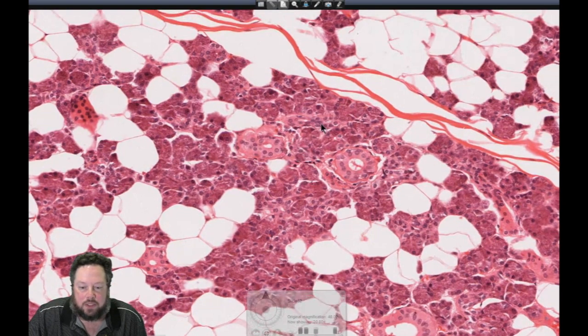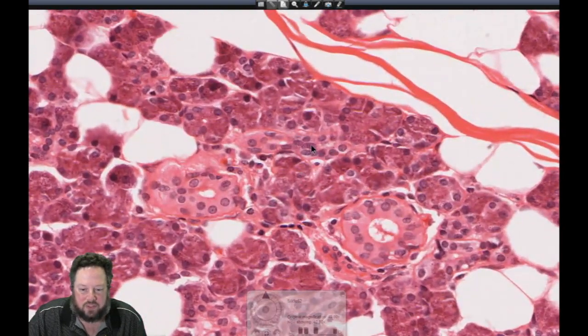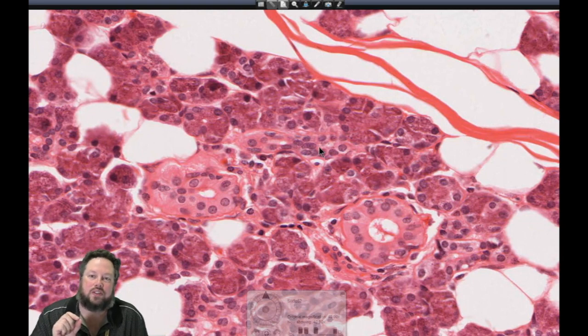And so it does sometimes, here's one here. So you can see these cells look very different to these serous acini here. So this is an intercalated duct. They usually start off as sort of a simple squamous, very low cuboidal, and then eventually become the striated ducts, which have more of a tall cuboidal, low columnar type of appearance.